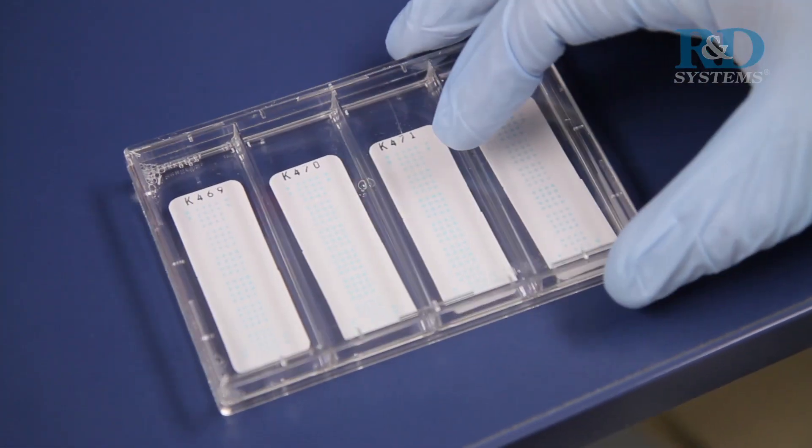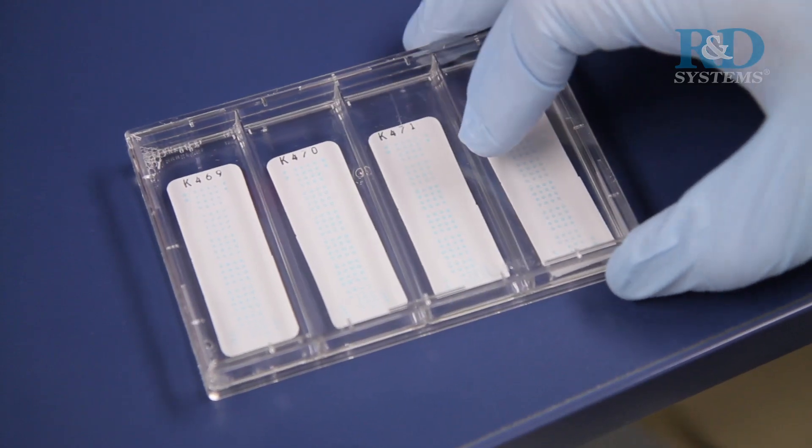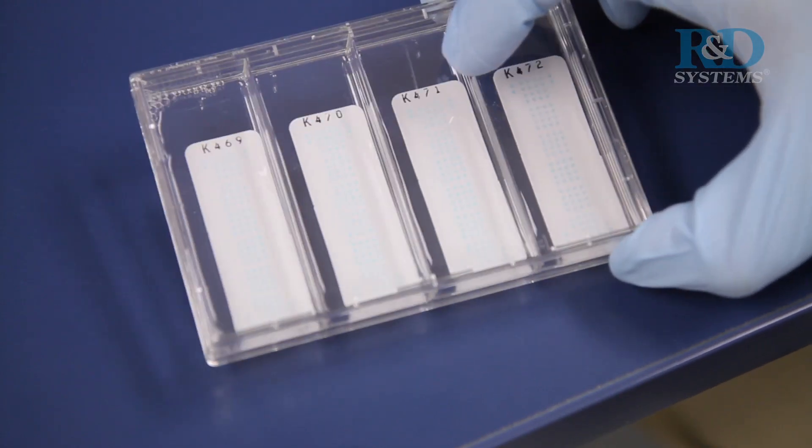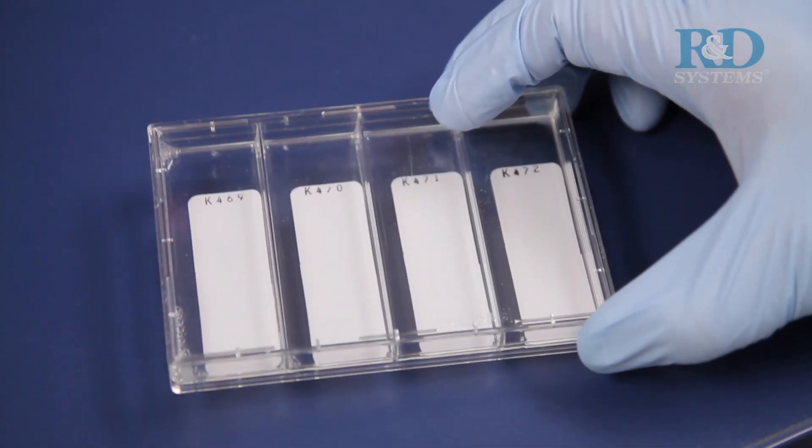Upon contact with array buffer 1, the blue dye from the spots will disappear, but the capture antibodies are retained in their specific locations.